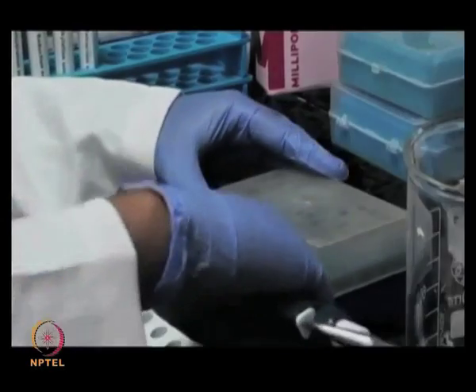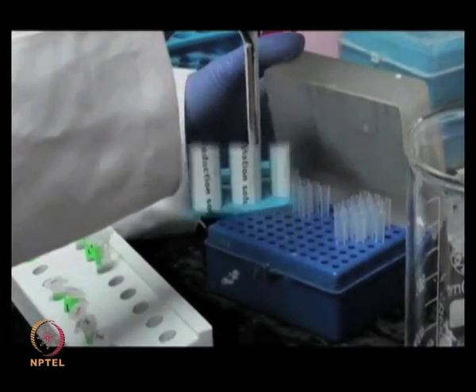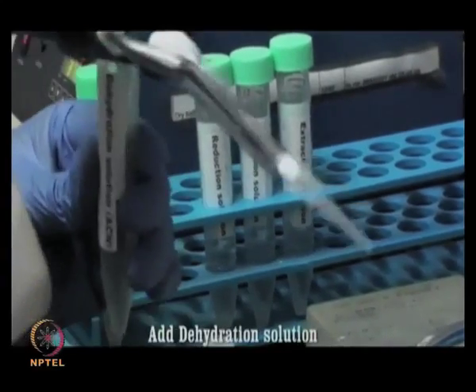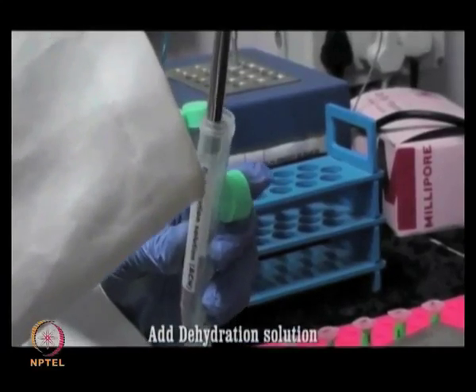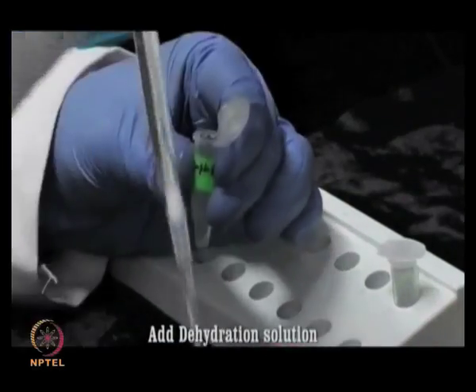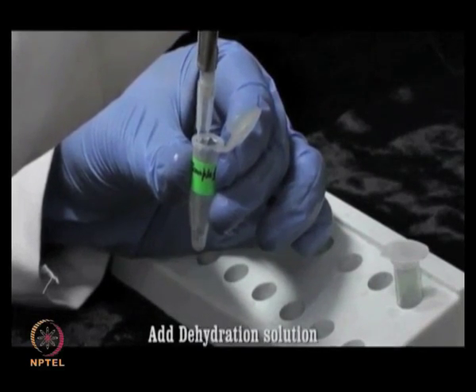So, you have seen the animation. Now, once the stain is removed, you can add dehydration solution. Add 50 to 100 microliters of dehydration solution and rotate it at room temperature.